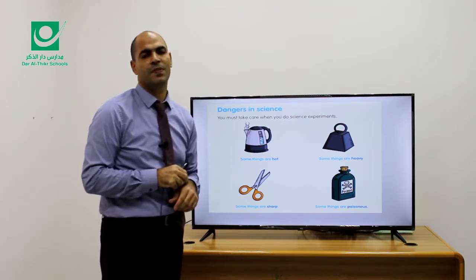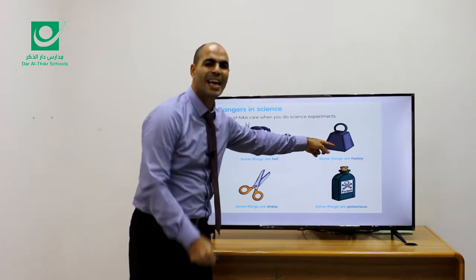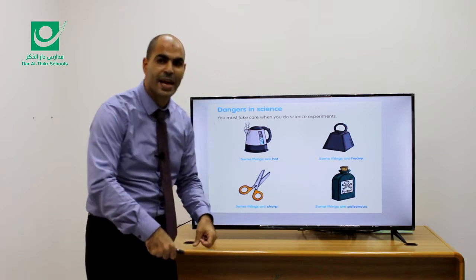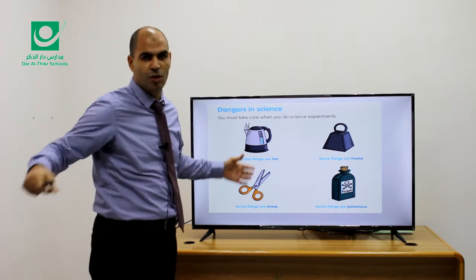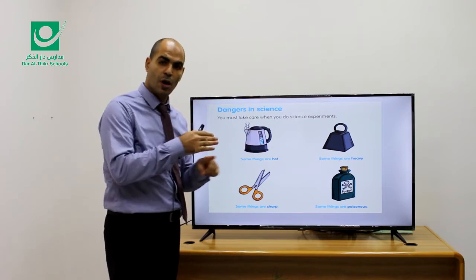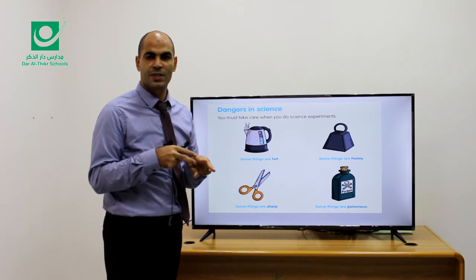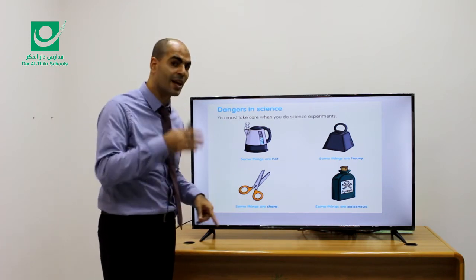And it will make you feel terrible. Also, some things are heavy, and if you try to carry a heavy thing, it may hurt your back and your bones. Some things are sharp. It might cut your skin or your finger or parts of your body, like the scissors, like the knives.